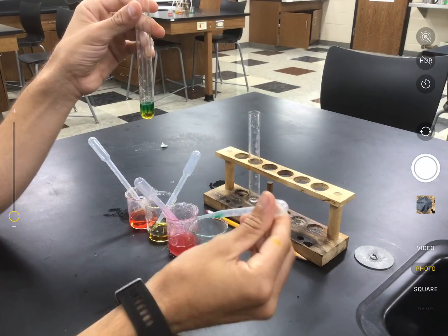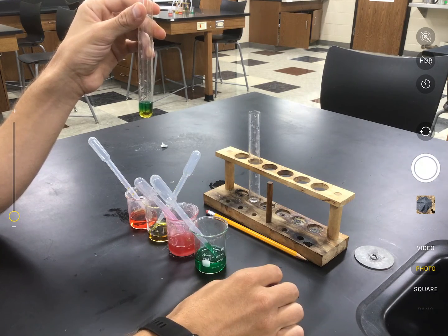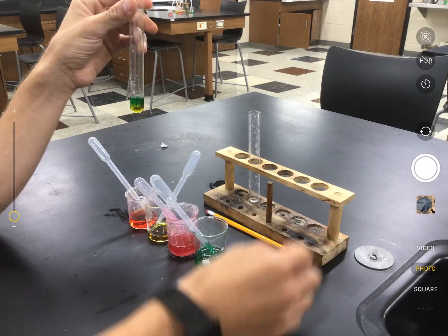Okay, so you'll notice that we have two stripes of liquid. So right now, yellow is more dense than green because it's on the bottom.